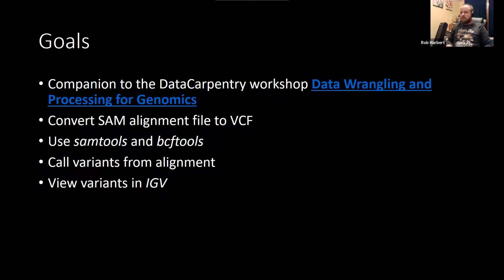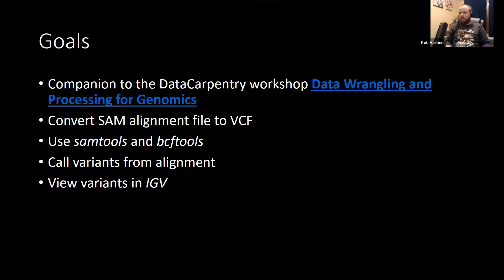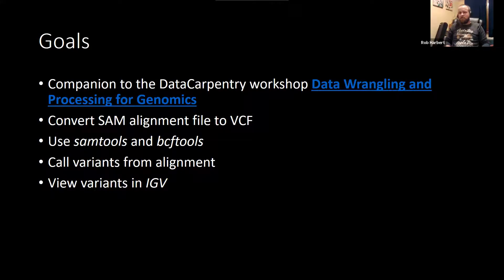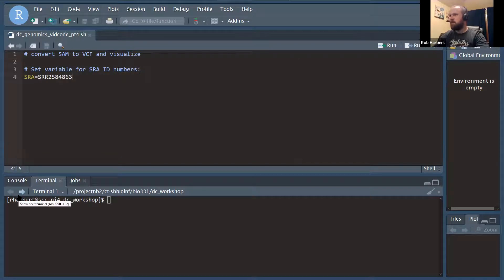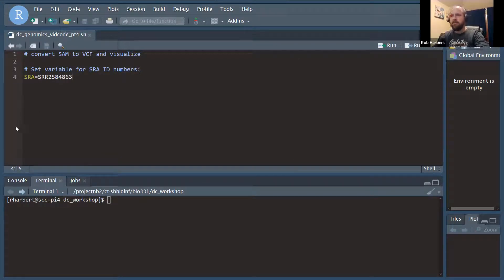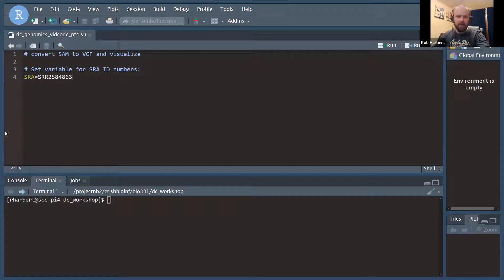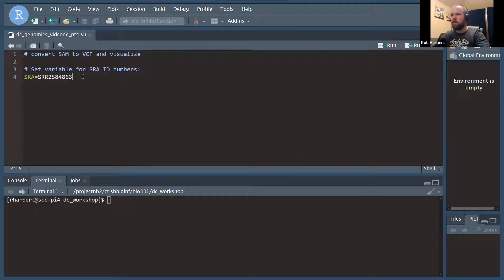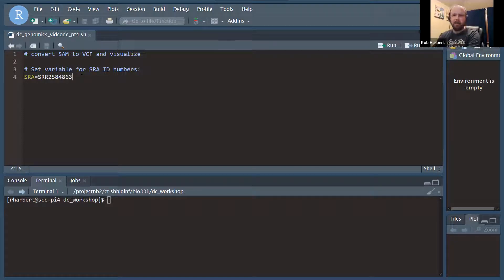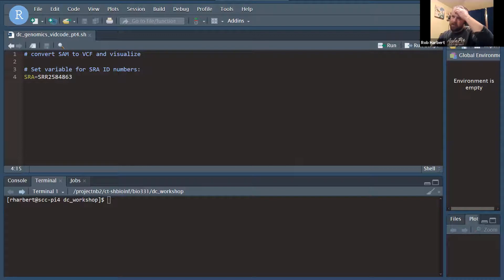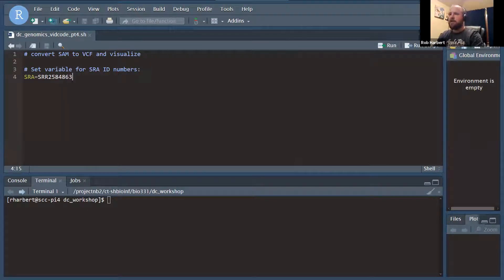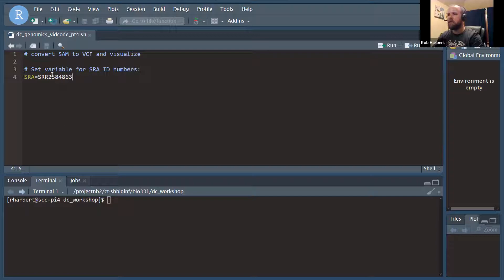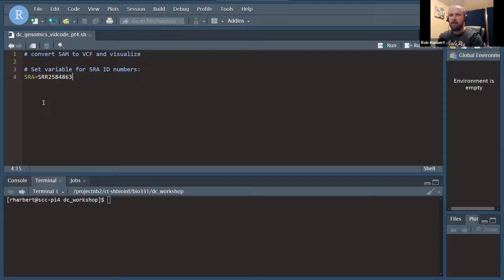This is the part where we're going to work on converting our SAM files that we obtained from BWA read mapping last time, converting those to VCF files and then viewing those. I want to take a little bit of time to make this reusable. I'm going to do that by declaring a variable that I'm calling SRA and giving the SRA ID number for one of our samples here. We're going to reference that number in our code to give us file names. That way, when we go back to redo this for the other samples, all we have to do is change this SRA number here.